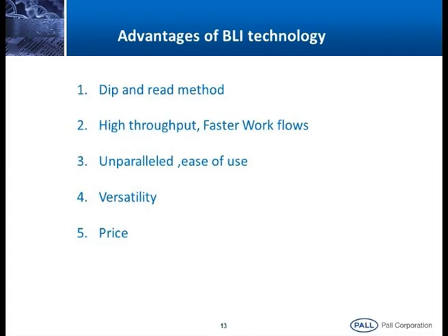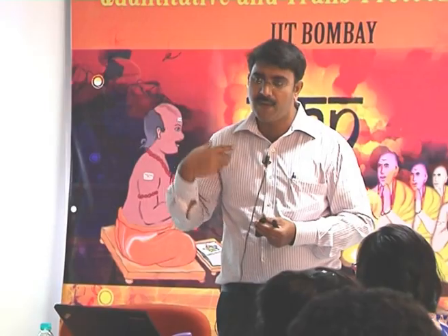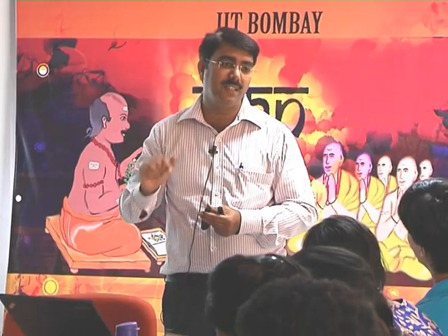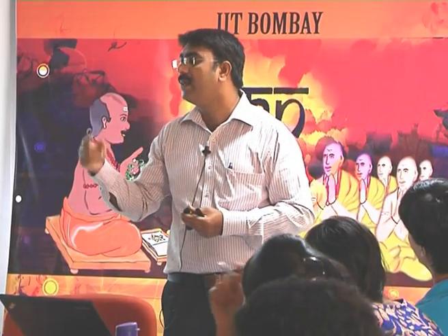In case of the SPR, it works on the principle of microfluidics. You know, in HPLC there are pumps, peristaltic pumps, which deliver the mobile phases. In case of the SPR also, there are buffer systems which deliver the mobile phase or the buffers on the sensor surface. So what happens is, in microfluidic devices we can't use crude samples. Suppose you want to do a serum sample analysis, or the body fluids, or the samples from the bioreactor itself, because they contain so many other contaminants, it blocks the flow cell. Once it blocks the flow cell, we have to replace the complete assembly. That is what is expensive in case of the SPR microfluidic devices.